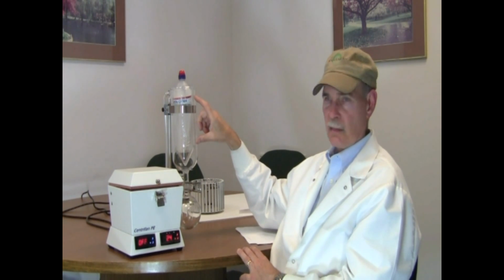Finally, if you've got DMSO, DMF solvents, very high boiling solvents that are going to take a while to evaporate, potentially overnight, the recommendation would be to get perhaps a chilled coil driven from a mechanical chiller or a mechanical cold trap like you might buy from Conco, and replumb the units. Don't even use the glass cold trap, but go to a mechanical trap instead in order to deal with the very long, potentially overnight evaporation times of some of the highest boiling solvents.